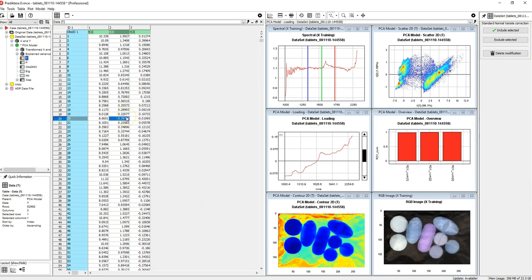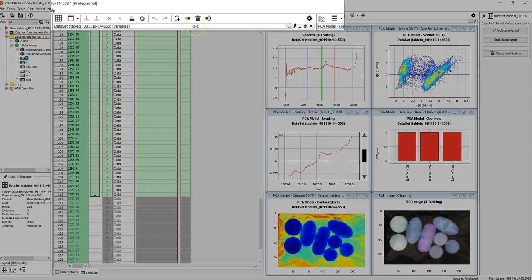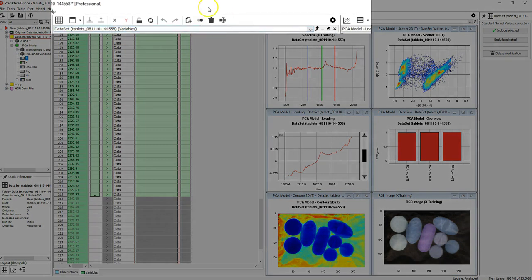At the top of the table area, there is a menu to switch between different tables and a toolbar for commonly used tools.